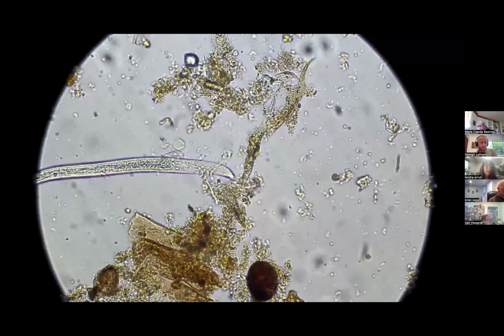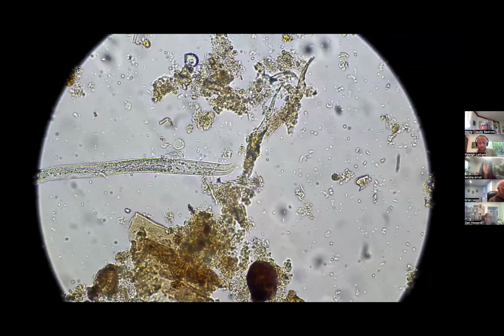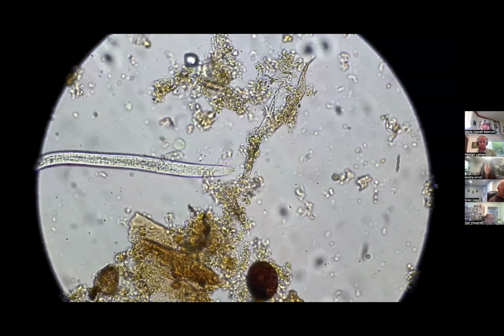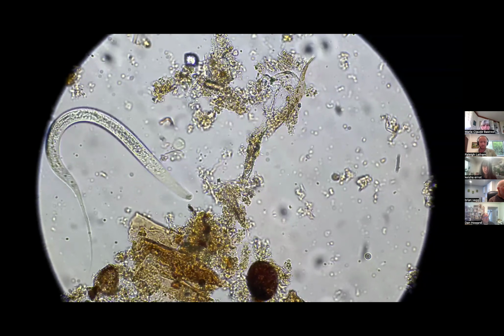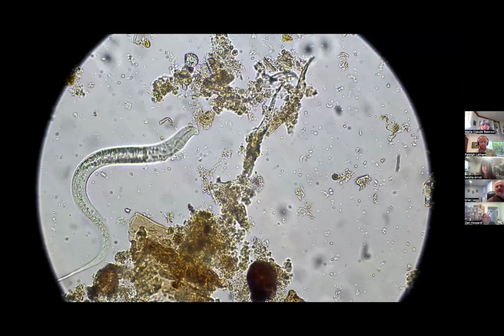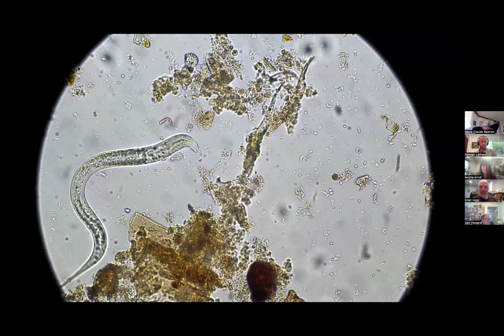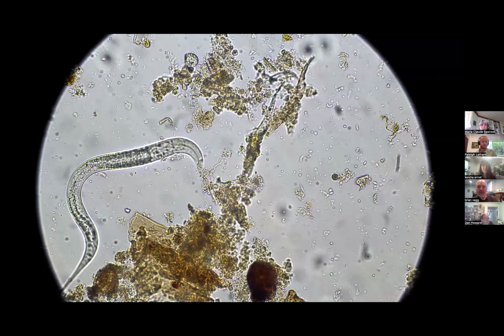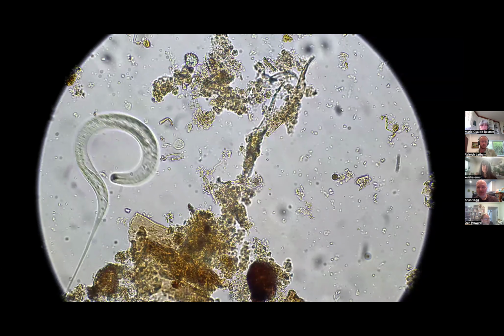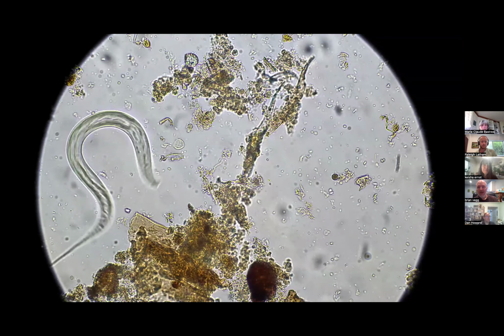Hey, Brian, there's a question. Since you've got a nematode right there, should there be a good free living nematode population? Free living, I guess, is maybe a somewhat subjective term. We want to see a lot of diversity of nematodes in healthy soils.